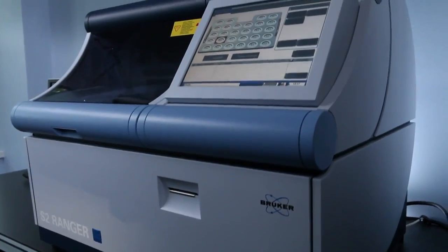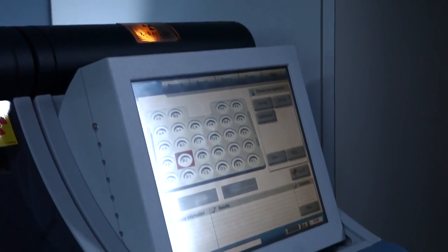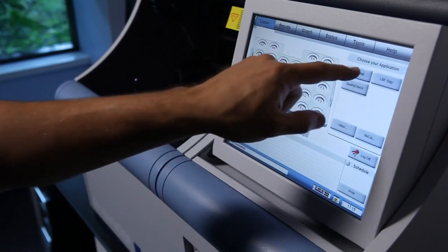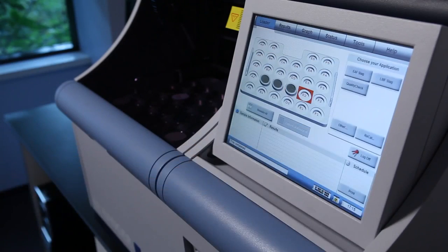When I was new to the field, the S2 Ranger was the first instrument that I learned. It took me about 20 minutes and I was able to independently start and finish a sample on my own. The touch screen on the S2 Ranger is very intuitive. After a short tutorial, you can start running your own samples and getting a feel for the software. It also comes in different languages and you can configure it to your specific needs.